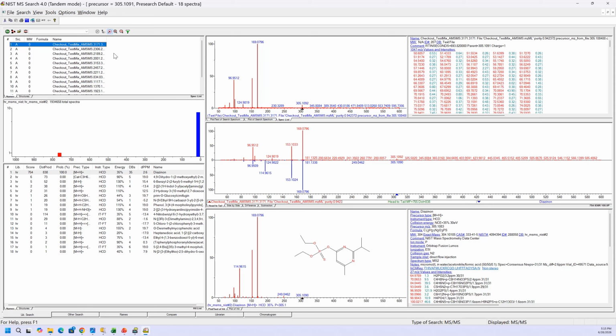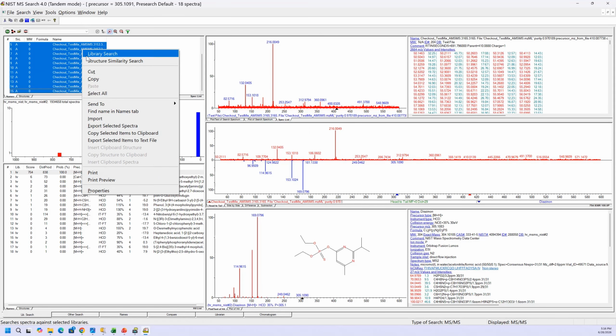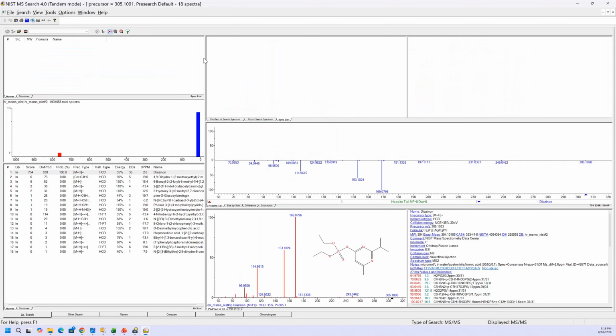It'll straighten things up. The other thing is you get all these ones that you sent over and they kind of take up room in your spec list. So you can select the top one if you want. And I left clicked on it. I'll hold the shift key. I'll go to the bottom, select the last one, and then just say cut. Now you've cleaned up the workspace, gotten rid of these temporary files, and just a little housekeeping that makes navigating the program a little bit better and saves a little room on your hard drive.